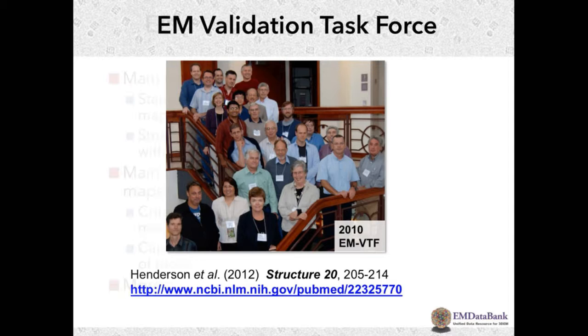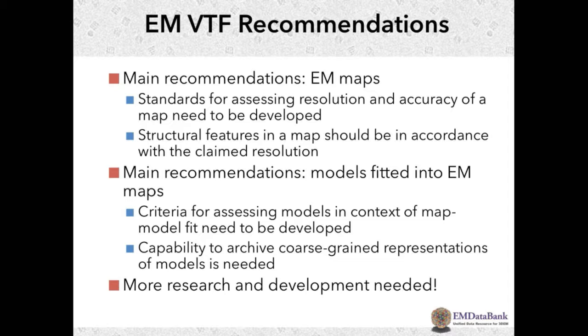I'm just going to summarize what was provided in that paper. So for EM maps, I guess because it's a young field, it should perhaps not be too surprising that they said standards for assessing resolution and accuracy of a map need to be developed. But they also made the statement that structural features in a map should be in accordance with the claimed resolution. I'll say a little more about that in the next slide.